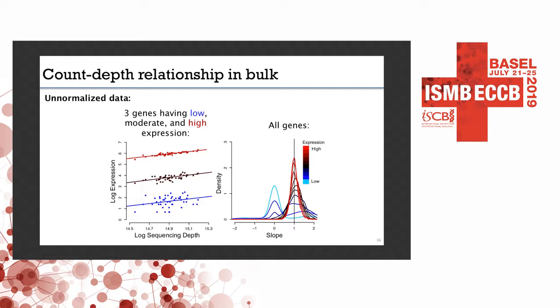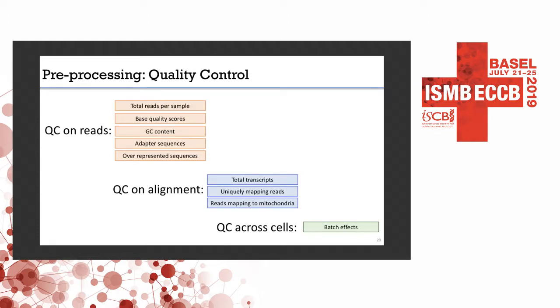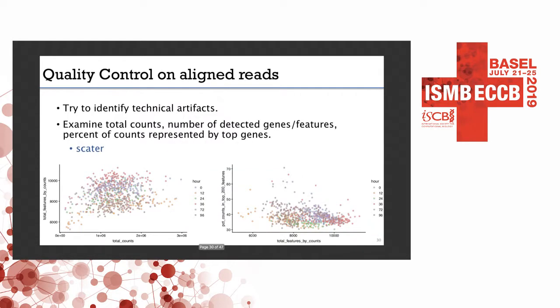When you talk about QC, what type of metrics do you use, and when do you determine to fail a sample or not? So the QC is a lot of the same. I would look at FastQC metrics, so looking at overrepresented sequences, for example, to check for contamination, looking at the GC content distribution, the base quality scores, or the total reads per sample. But for specific cells, I didn't put this here, but I might look at mitochondrial reads. For example, if there are cells that have more than 50% of their reads from mitochondrial genes, I might exclude those. It's going to be more data set specific, because I've seen data sets where all cells have less than 20% mitochondrial reads, and then I've seen cases where almost all cells have 40 to 50% mitochondrial reads.